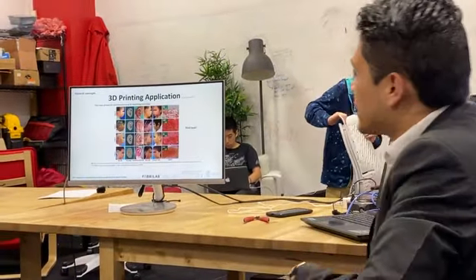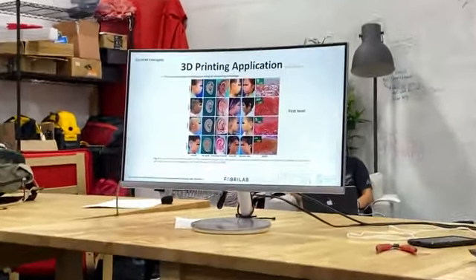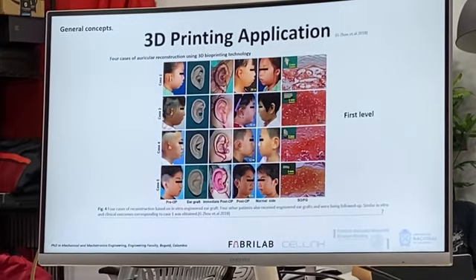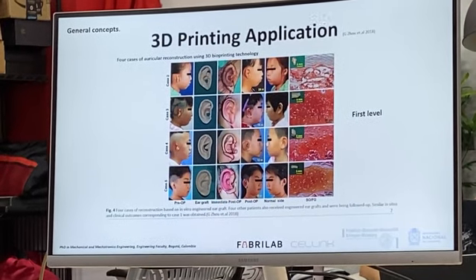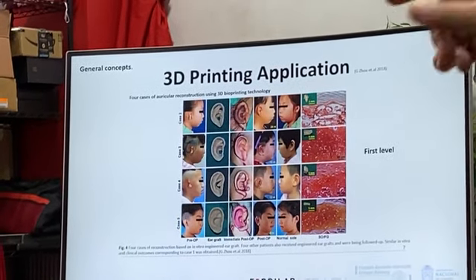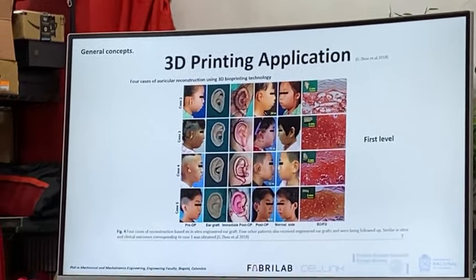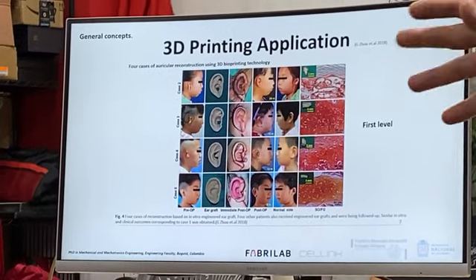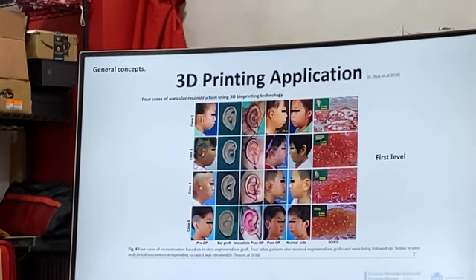So here are some applications in the real world where you can use 3D bioprinting technology. This is an example from China, a university there in a research lab. They made an experiment with 5 children. There are 4 here, but in the real paper you can find the 5 examples. You print the ear scaffold, and you seed the scaffold with their own cells. After a while, you can implant that to the children, like you can see here in the sample.